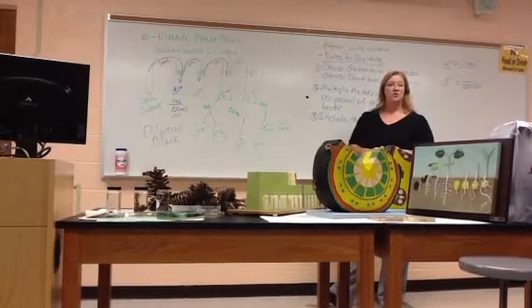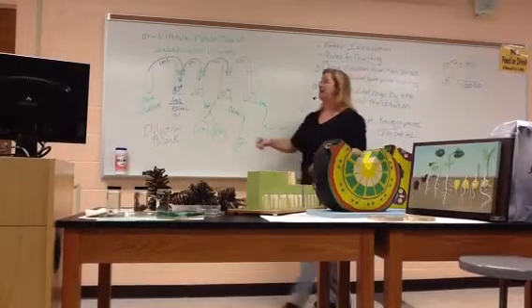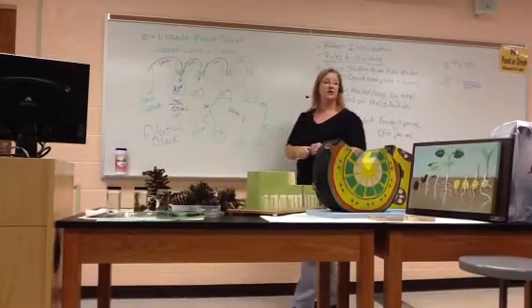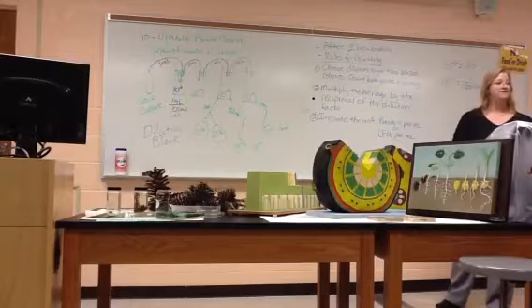Everybody follow what we did with the serial dilution there, using one dilution to make the next, and it's quantitative because we're actually measuring how much liquid we're moving, 1 milliliter of liquid. Any questions so far?